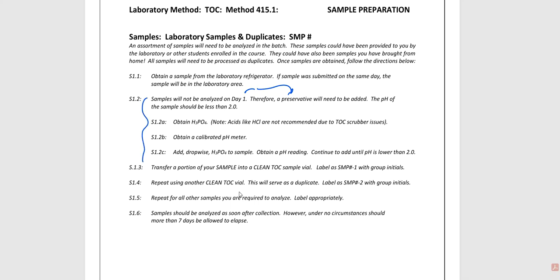There is a chance that we will skip this, depending on the year. And we will definitely skip it if we tell you ahead of time, listen, today we're making standards, we're getting everything organized, ready to run. The next day that you see us, we want you to bring samples. Collect those samples fresh, preferably the day that you come to campus. If you collect them that day that you come to campus, there's no need for us to pH them and go through this mess. Just bring them on in, and then we will take over from there, and we'll go ahead and analyze them. So we will not acidify them in order to preserve them.